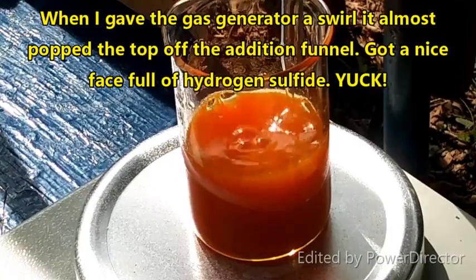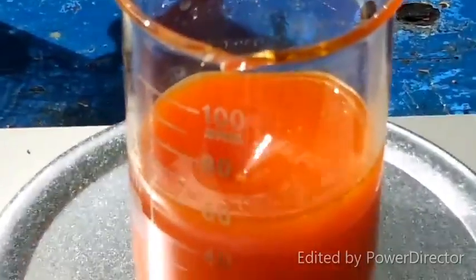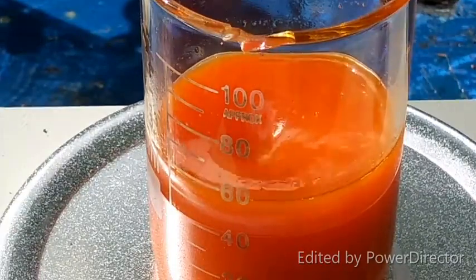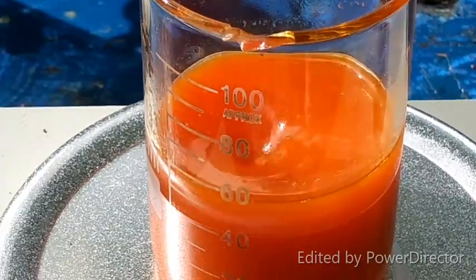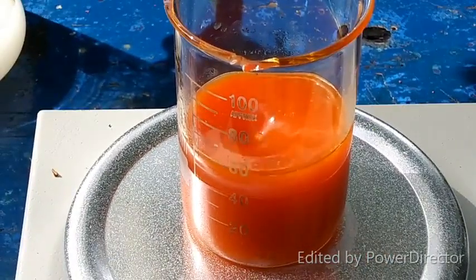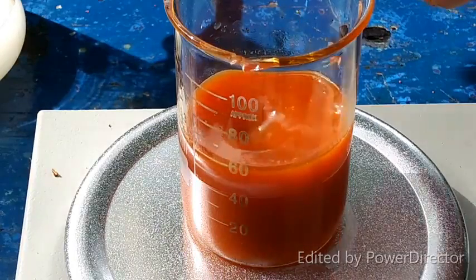Okay. So now, let's take a look at our little creation here. Perhaps where you guys can see the color a little better. Alright, so as you can see, nice vivid orange. Now we are going to go ahead and add alkali to this, and that should give us our uranium red. In fact, here we go. Let's just do this.